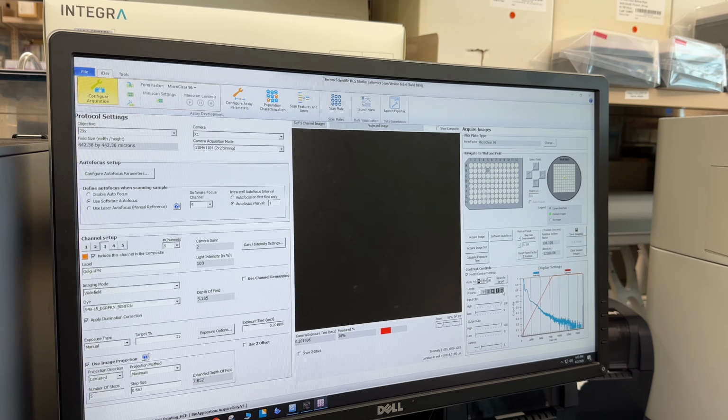Let's say you have a population of cells, right? And within that population of cells, you would have some subpopulations that are different, going through a different biological process. But when you take an average summary of that, you are condensing that into a single representation. So you're hiding all the biology that is associated with that population, and it is very important to account for that when doing high-content drug screens. So Buscar avoids the whole summarization part and treats that whole population at a single-cell level. Now we have the biological nuances that were never included in current metrics, which basically use average populations.